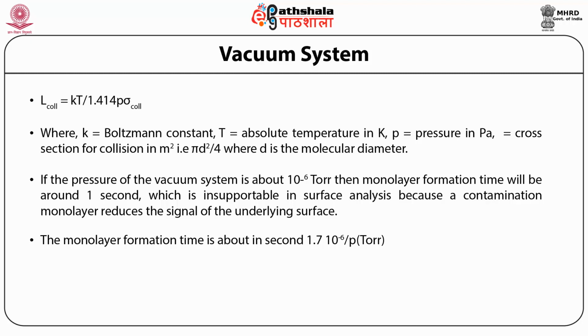Monolayer formation time is in seconds and about 1.7 into 10 to the power minus 6 divided by P, where P is in torr.